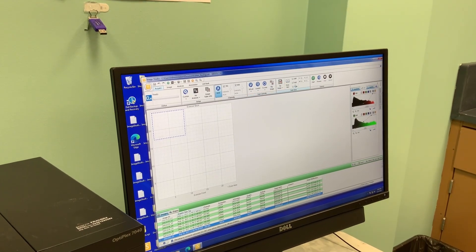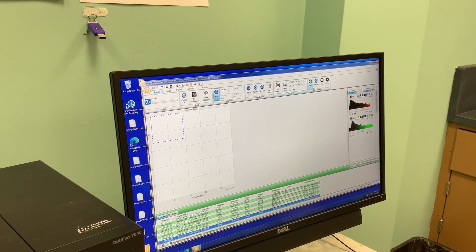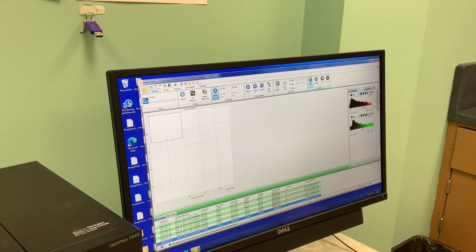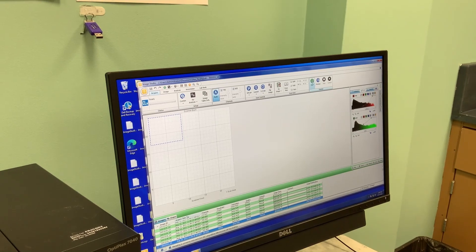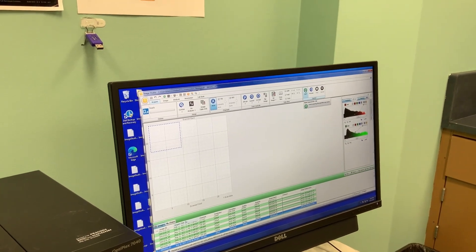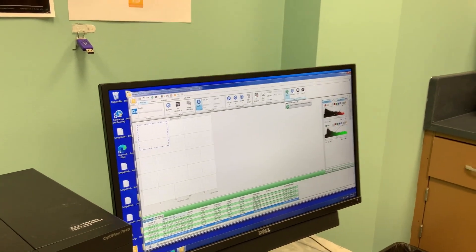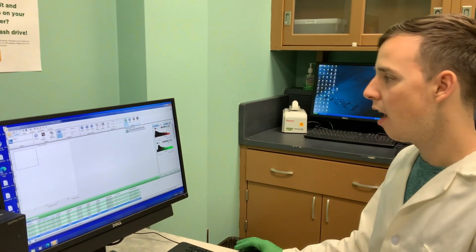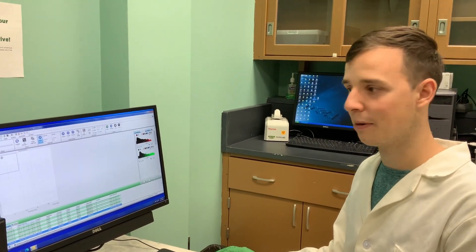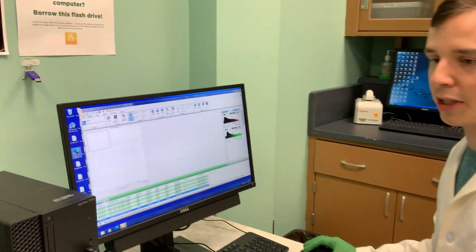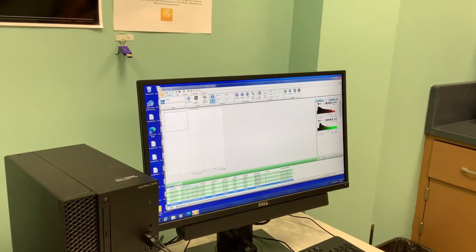Once we're ready we hit the start button. I'm not going to do that only because we have a piece of blotting paper in there and not a membrane, but this would take a few minutes to scan and we don't want to open the scanner bed while it's running.